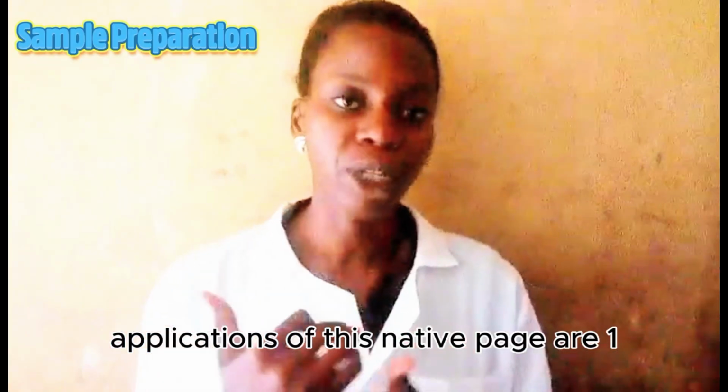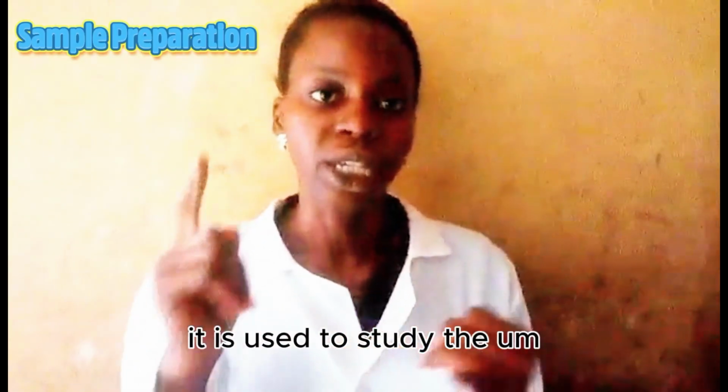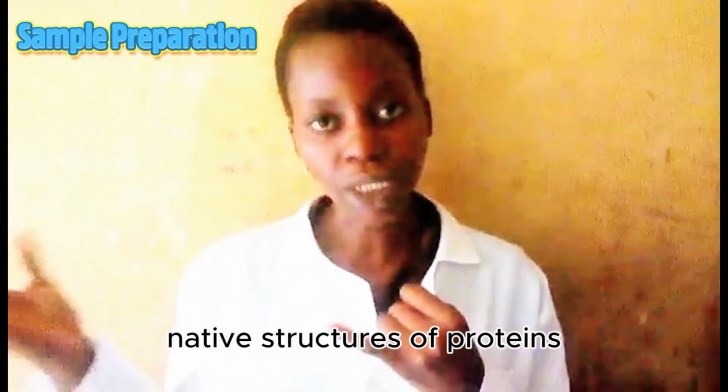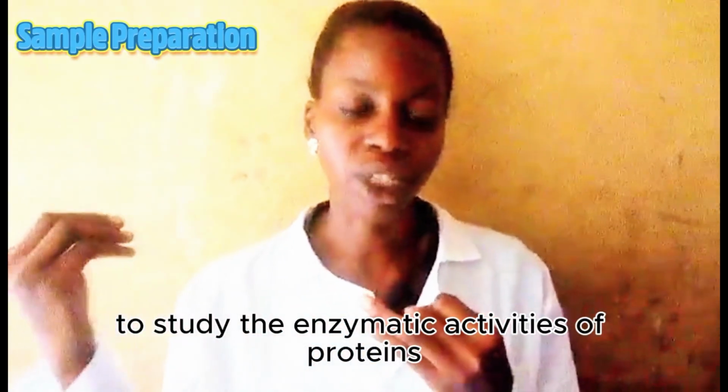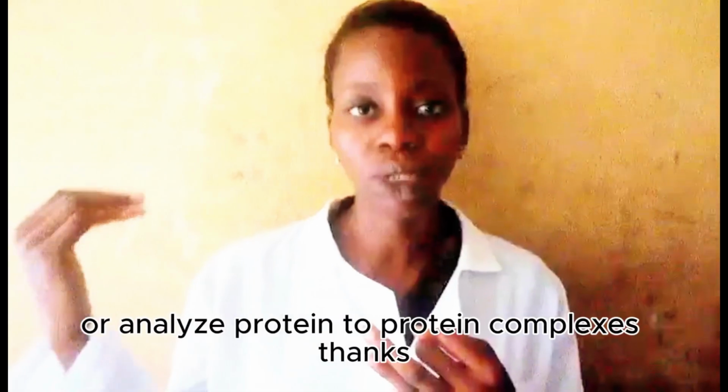Applications of this native PAGE are: one, it is used to study the native structures of proteins. Secondly, it is also used to study the enzymatic activities of proteins or analyze protein-to-protein complexes.